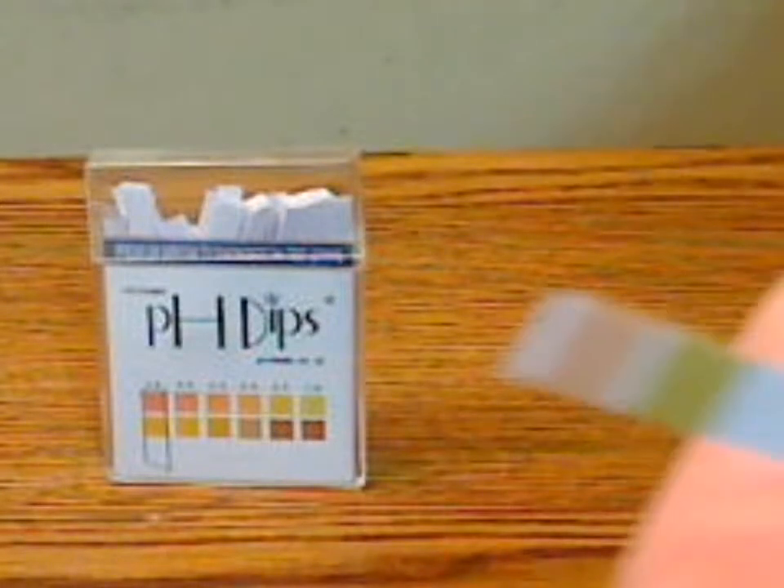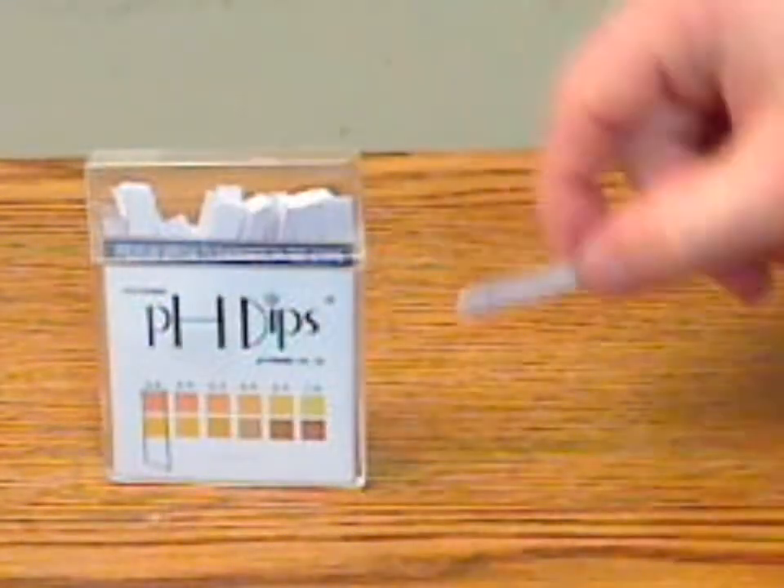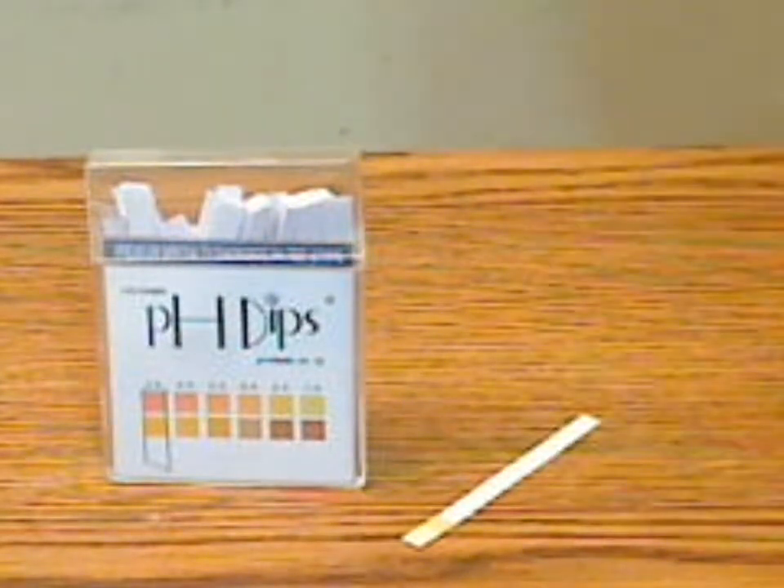Here's an example of what they look like — the strips here. They change color fairly quickly.